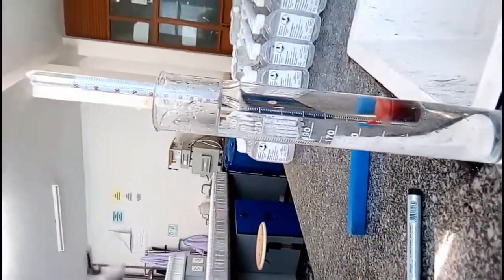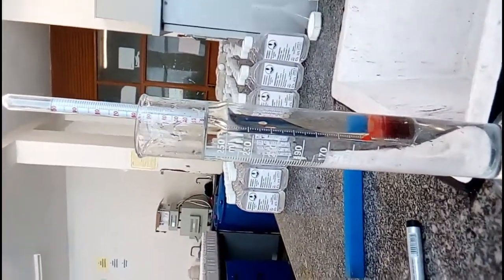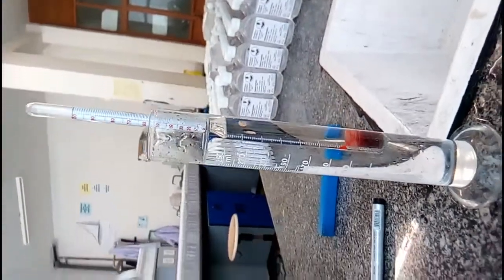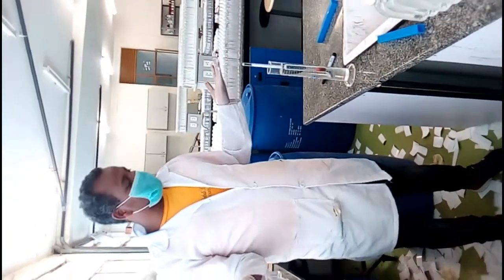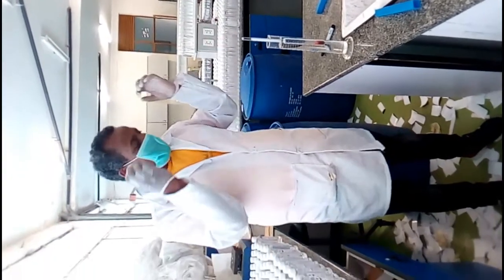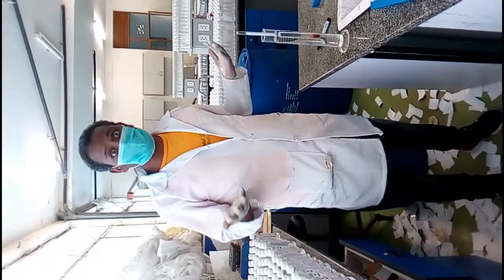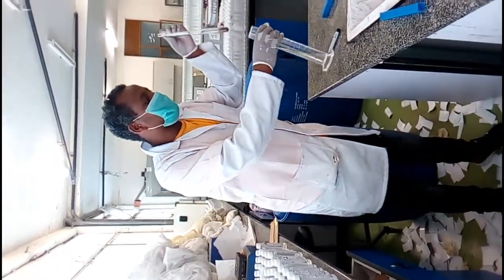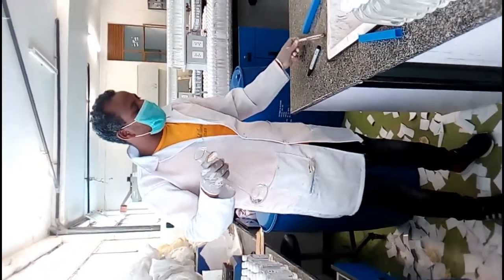The reading shows 0. Is that right? Yes, it is visible. Okay. That means 0 means we can say that there is no alcohol in the water sample. This water has no ethanol, so we can say this is pure water, containing no alcohol. So this instrument is a good instrument for checking the content. Now let's come to our sample, the normal sample prepared.